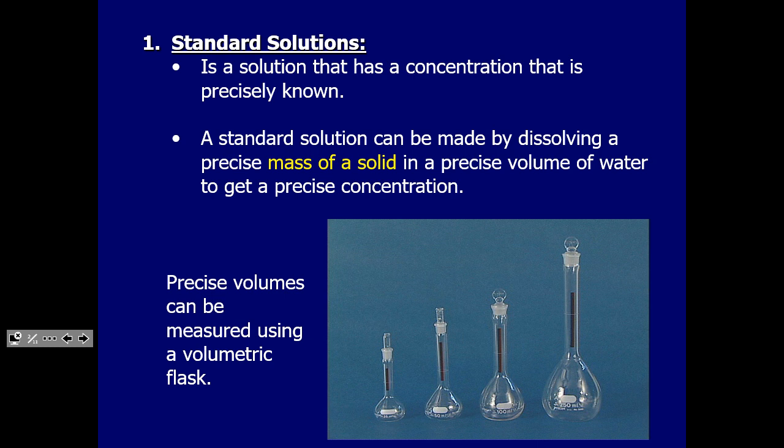This great big one here, I use it quite a bit to make large volumes of acids and bases. This one's 2,000 plus or minus 0.5, which means the error is in the first decimal. So I've got 2000. It's exactly 2,000, 4 significant digits in this. So I can get it very, very precisely. All right. I will talk about these devices when we talk about dilution.